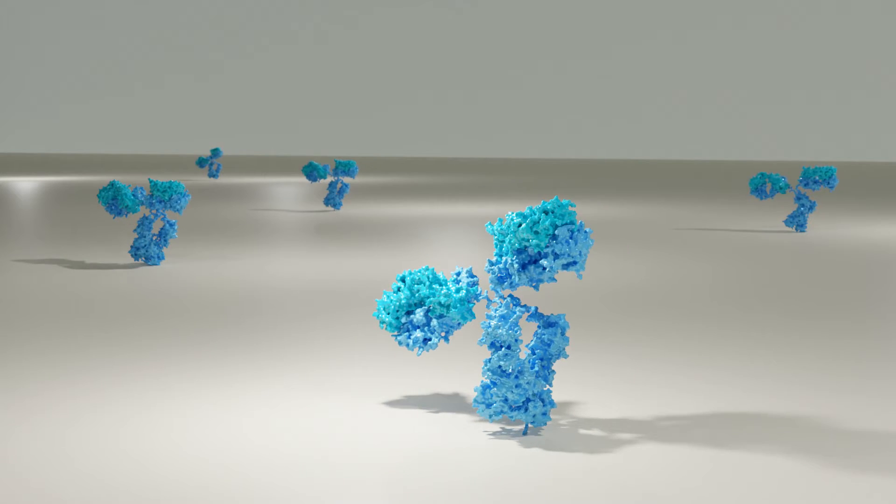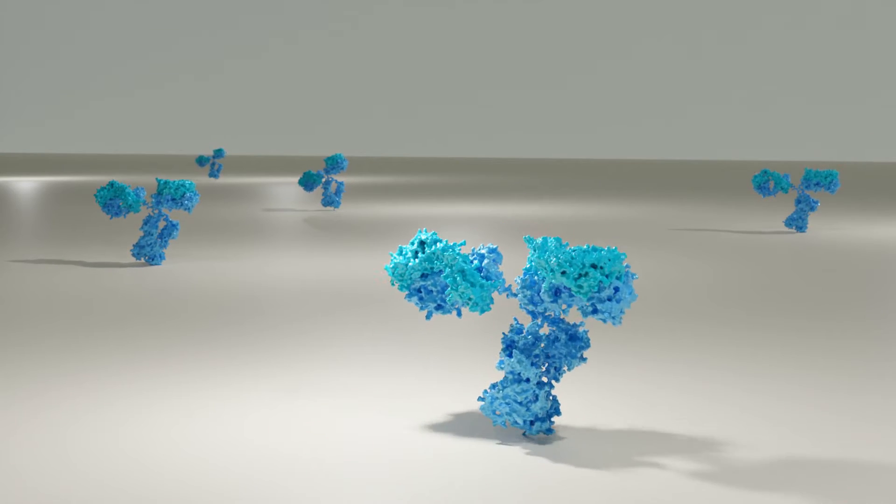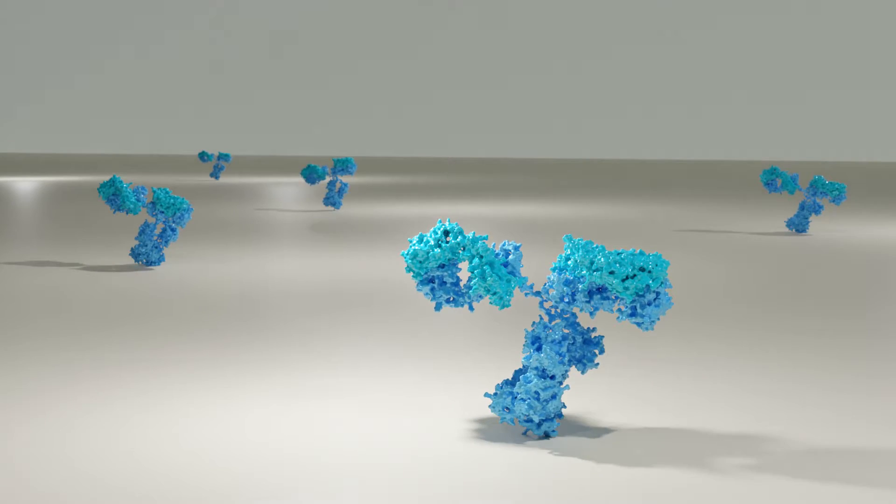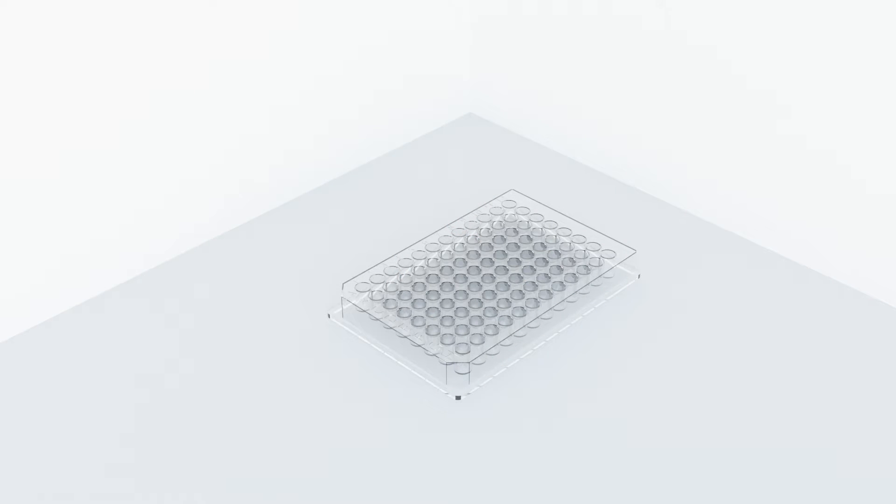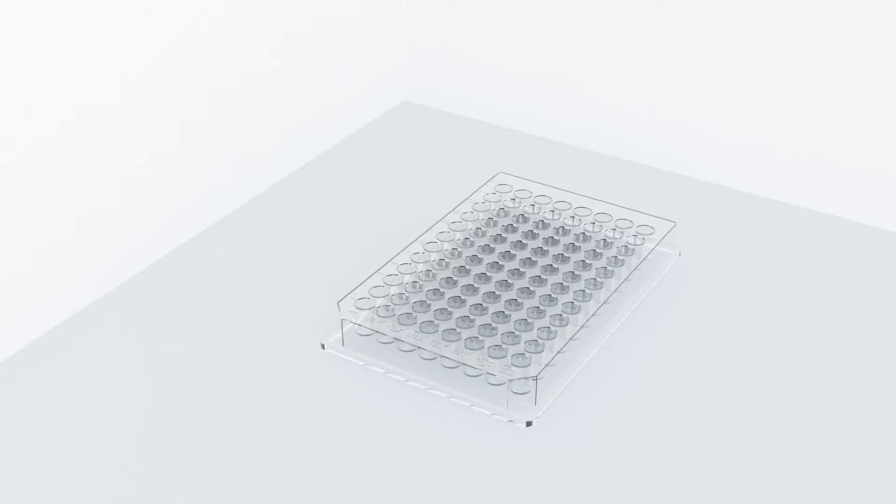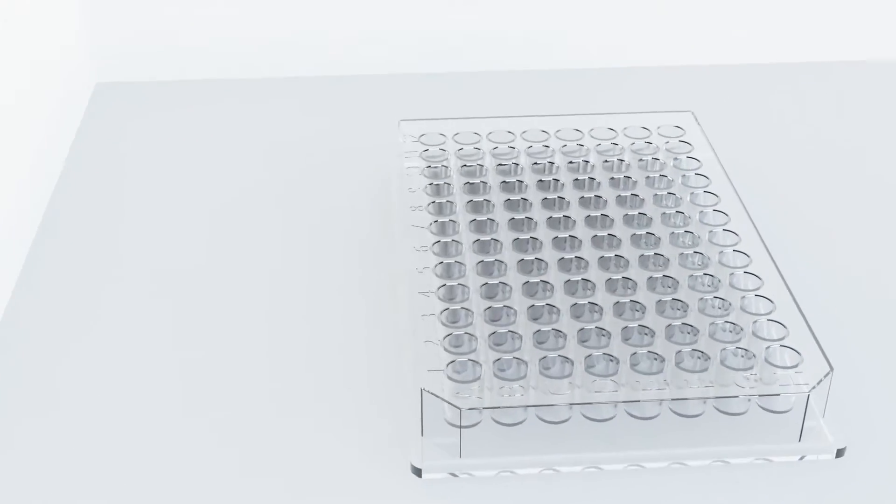ELISA lab presents the enzyme linked immunoabsorbent assay. ELISA assays are typically done in 96 well plates. Let's see what is in the bottom of the well. A bait is linked to the plastic of the well.